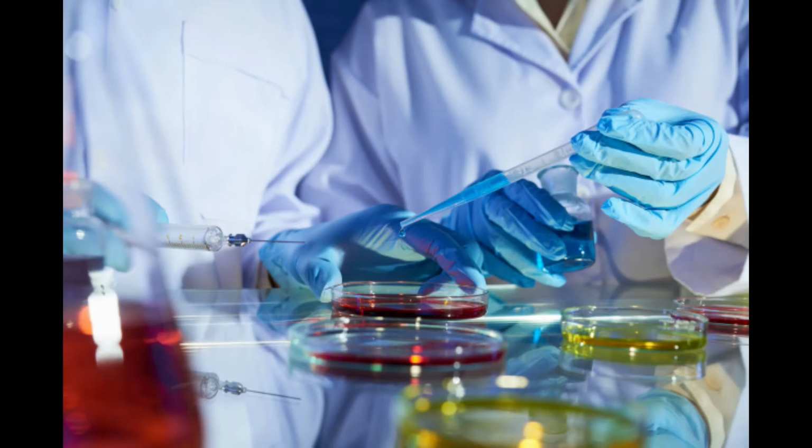Your Bunsen burner will be lit. So first thing you'll do is you're going to flame your metal inoculating loop, and you'll just hold it over the flame until it turns red. And then once it turns red, you'll pull it off and let it cool for just a second, right? If you dip it into your Serratia when it's still red hot, you're going to kill whatever you touch. So give it a second. Dip your microbe out. Take the lid off of your broth.